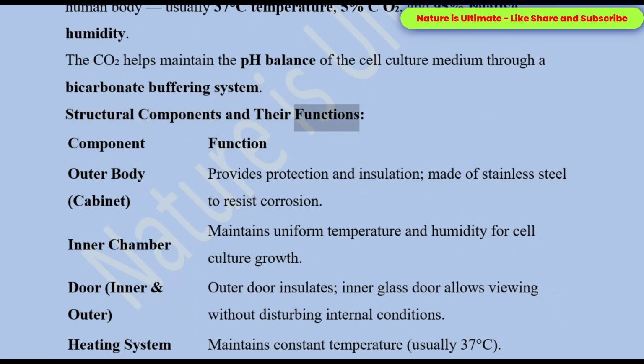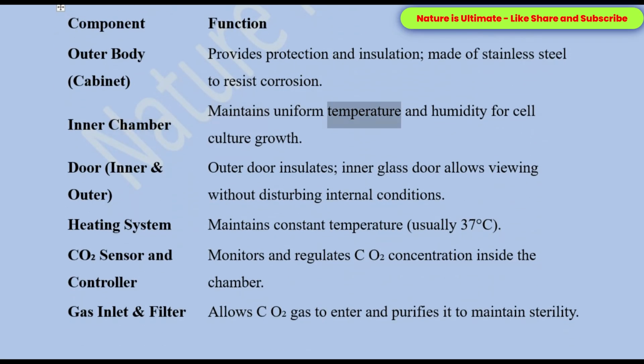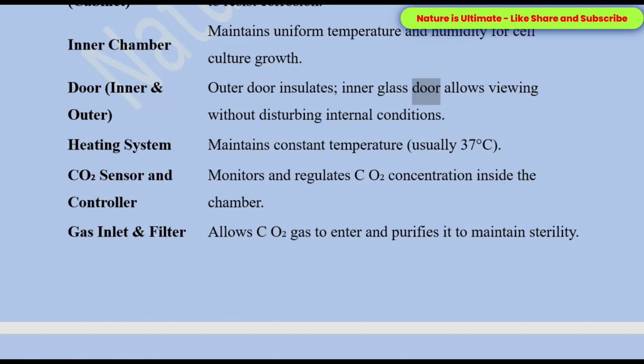Structural components and their functions. Component. Function. Outer body, cabinet. Provides protection and insulation, made of stainless steel to resist corrosion. Inner chamber. Maintains uniform temperature and humidity for cell culture growth. Door, inner and outer. Outer door insulates, inner glass door allows viewing without disturbing internal conditions.